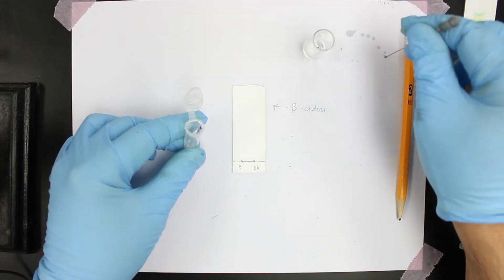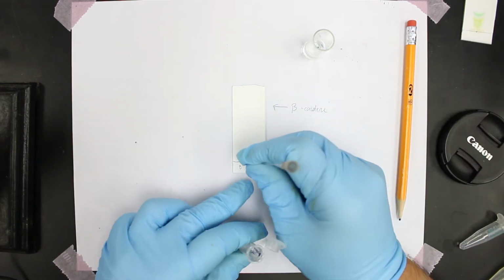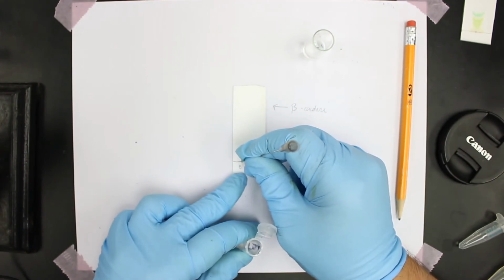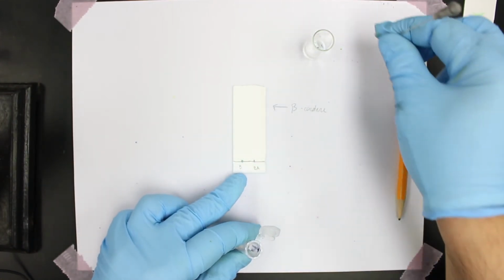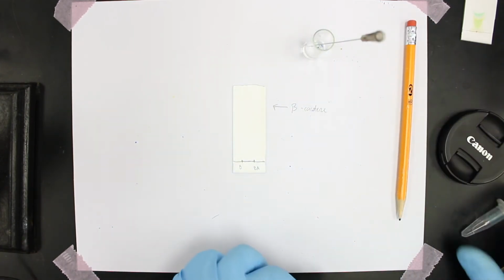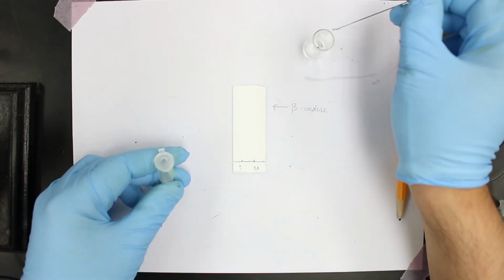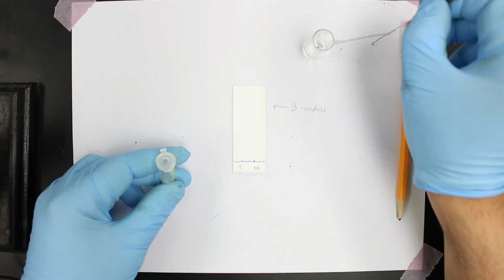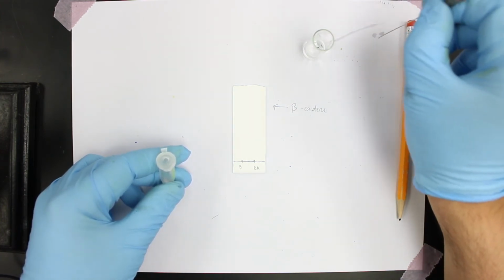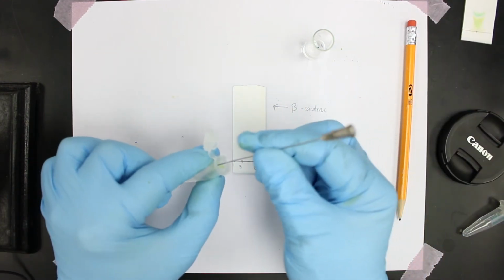So get all the acetone out of it. And this time, because it's not colored, we'll just give a few spots. Okay, cap that. Now we'll take our benzoic acid. Okay, so here's our benzoic acid solution.